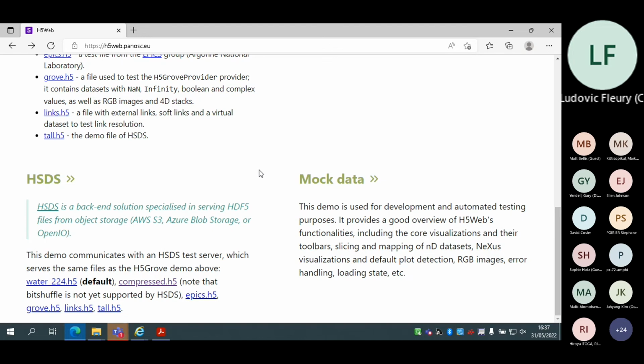So you mentioned that you basically work with users and you gather their feedback and continue development. As far as I know, at ESRF, the beamlines write their own HDF files? Almost, yes. Have you heard of use cases when they used Dectris H5 files to be displayed with your tool?